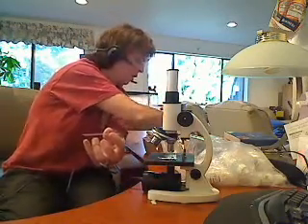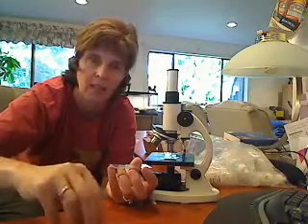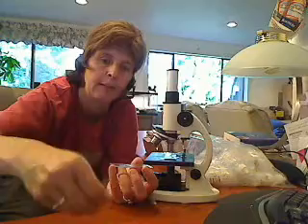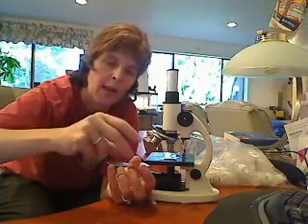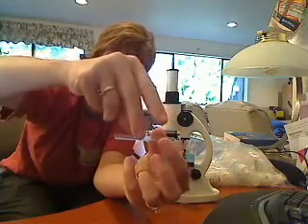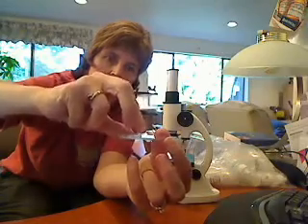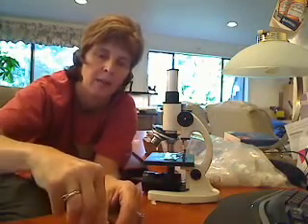Iodine is used — or used to be used — in hospitals quite a bit to sterilize. Then you want to find a cover slip. This is a technique called creating a wet mount. You place the cover slip at a 45-degree angle on the slide, then just drop it and gently tap it into place. Our slide's ready to go — we want to let that sit for about a minute so the stain can really get into those cells.